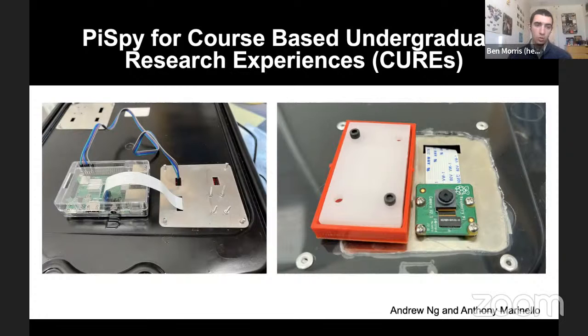And they could put one on either side of the box, with the lights also mounted underneath. So they could do a condition where it was always white light, a condition where they did the light cycling, and a condition where they had the white light on one side and the red light on the other side. And then they could image the food sources to see which food sources ants were eating or how much they were eating or things like that.